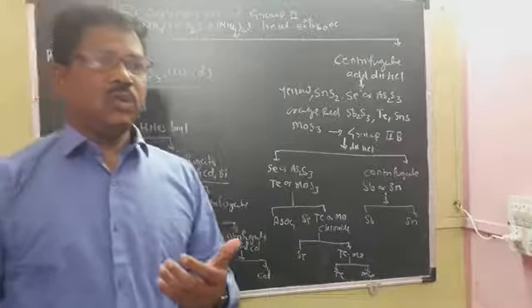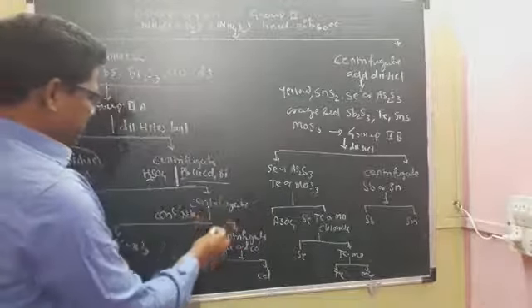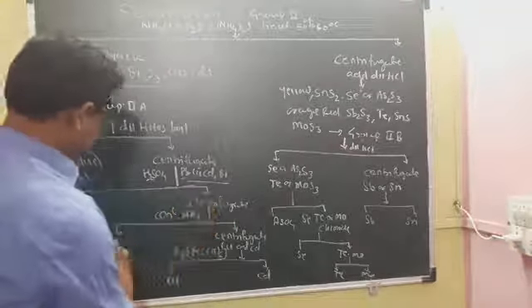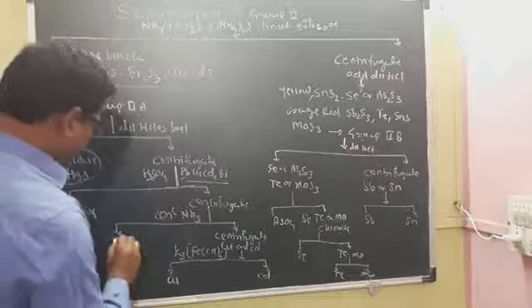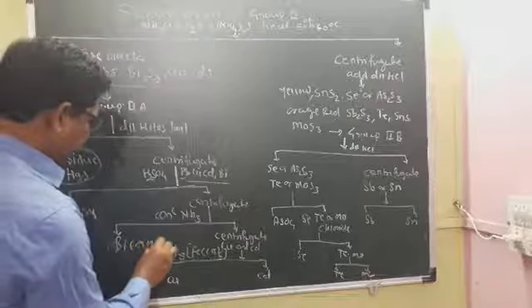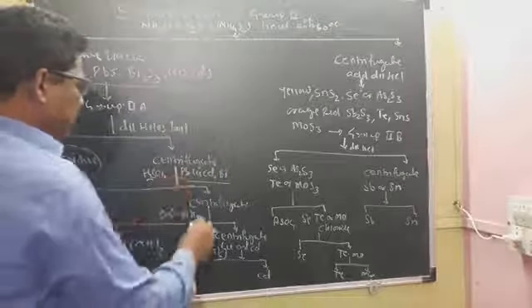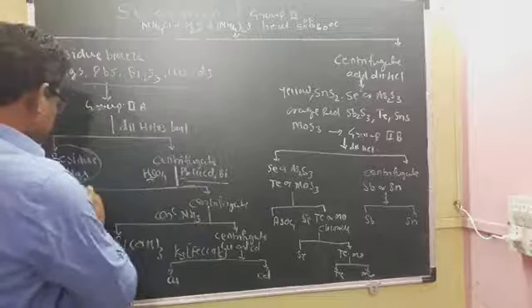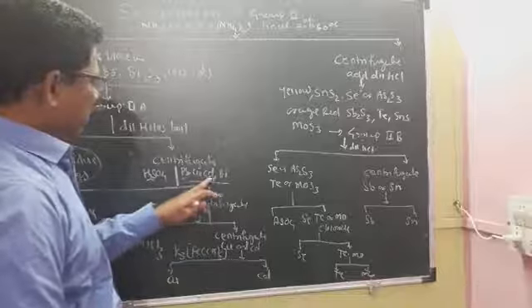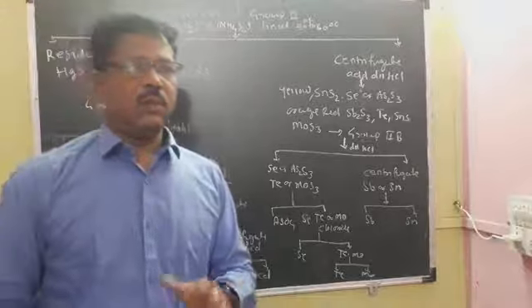Then add dilute H2SO4 till the precipitate of lead forms. With the addition of dilute sulfuric acid we get the precipitate of lead sulfate, and centrifuge; the centrifugate contains copper, cadmium, and bismuth.